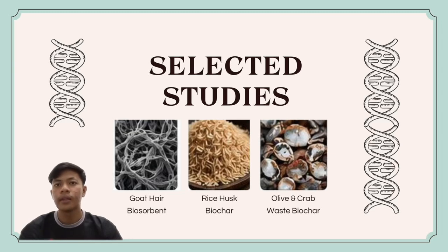In the third study, rice husks were obtained from rice mills located in Nasarawa State, Nigeria. Rice husk was selected as a low-cost agricultural waste material suitable for biochar production. Proper sampling is important because it ensures that the material accurately represents the characteristics required for environmental pollutant treatment.